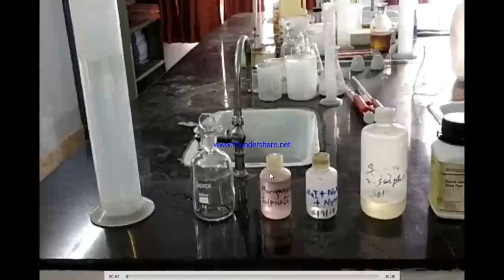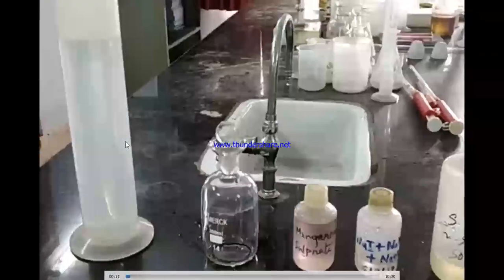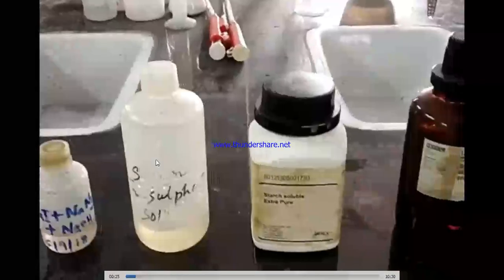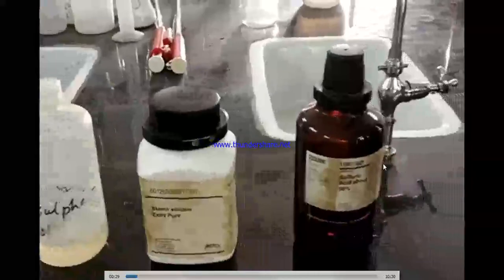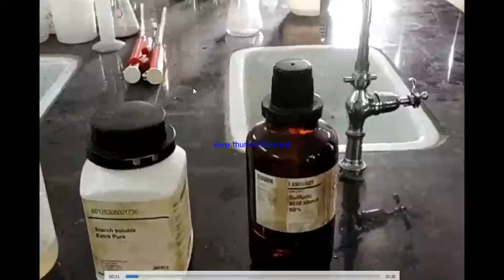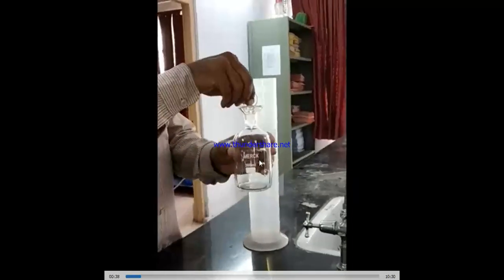So basically you are seeing the BOD bottle, manganese sulfate, then alkali iodide azide, and the water sample. This is the standard sodium thiosulfate solution. This is the starch indicator. This is concentrated H2SO4. These are the pipettes. Now this BOD bottle is of 300 ml capacity. This is the stopper or the cork.